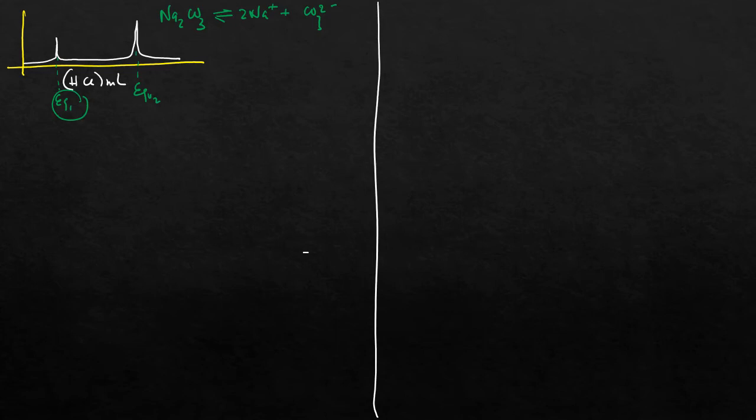Now, also look closely at this and you realize that the mole ratio of this equals that. So if I'm able to calculate the number of moles of that, that will be equivalent to the number of moles of sodium carbonate.